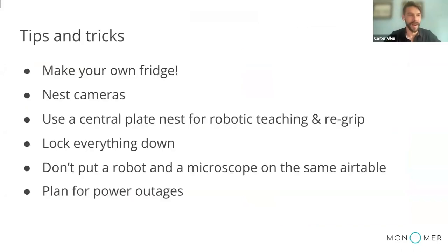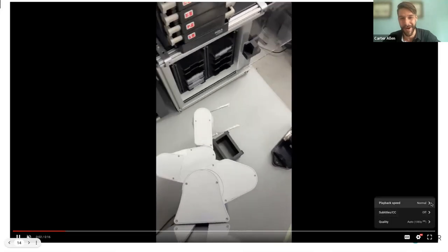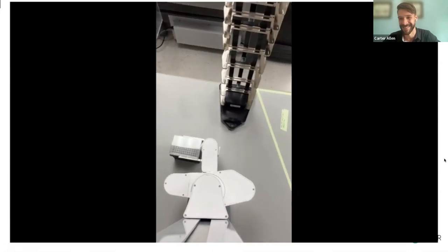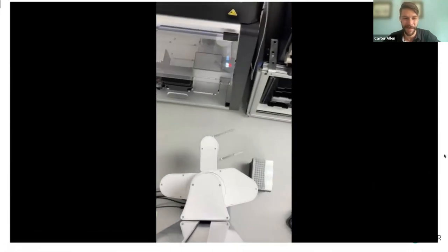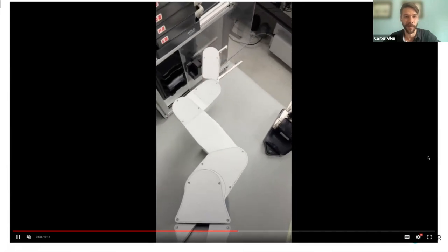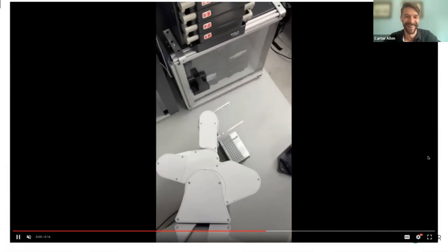Thanks, Sam. All right, so a few tips and tricks for building automated work cells are, first, to make your own fridge. Automated fridges can be quite expensive. And if you just have a few plates of media, your robot arm is strong enough to open and close sliding doors. So that's one tip. See this kind of cute anthropomorphic action here.